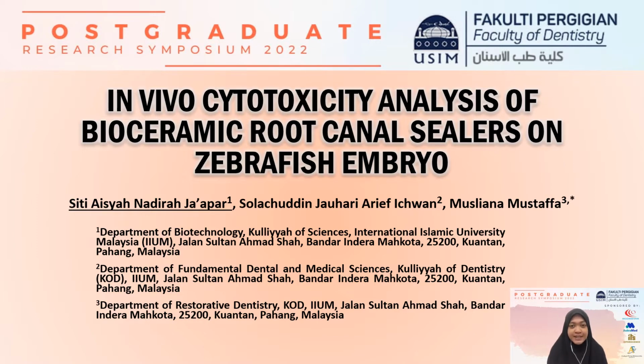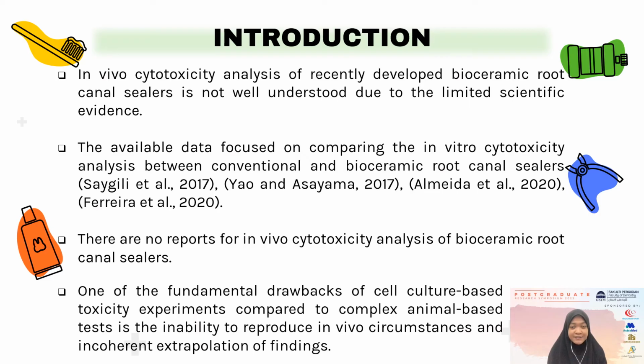Today, I'm going to present our research project entitled In Vivo Cytotoxicity Analysis of Bioceramic Root Canal Sealers on Zebrafish Embryo. For the introduction, an in vivo study is an experiment performed inside a living organism to allow the evaluation of embryo development, embryonic changes, and lifetime effects.